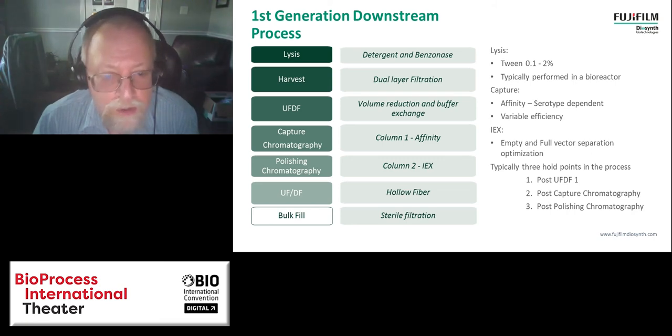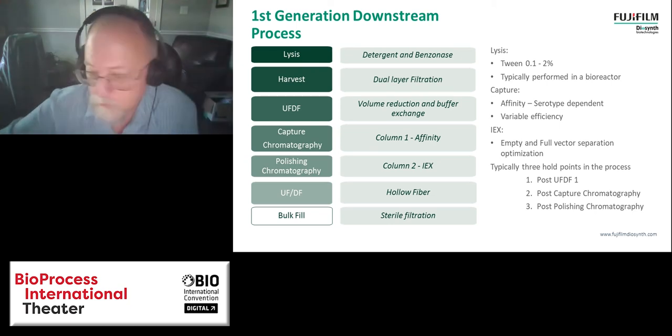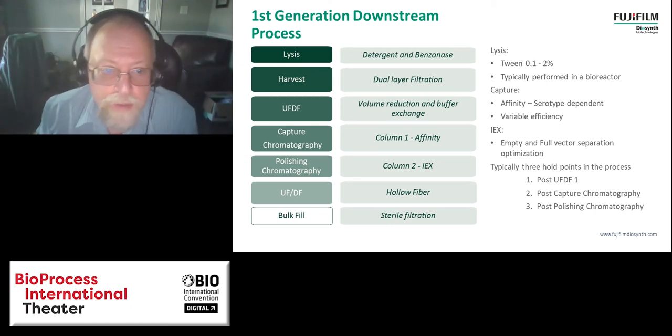Then we will utilize ion exchange chromatography to do a polishing step. We want to achieve the best removal of empty capsids from the material and give us a final full capsid situation of around 70 to 80% of the final particle number. And finally, we will do UF/DF and other post-capture steps to concentrate material and change buffer to a final buffer that clients may be interested in. And we will then do sterile filtration to have our final bulk drug substance.